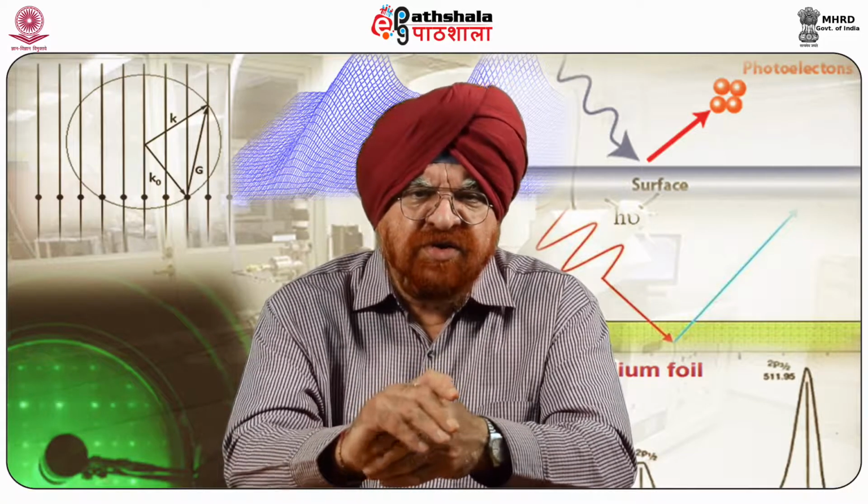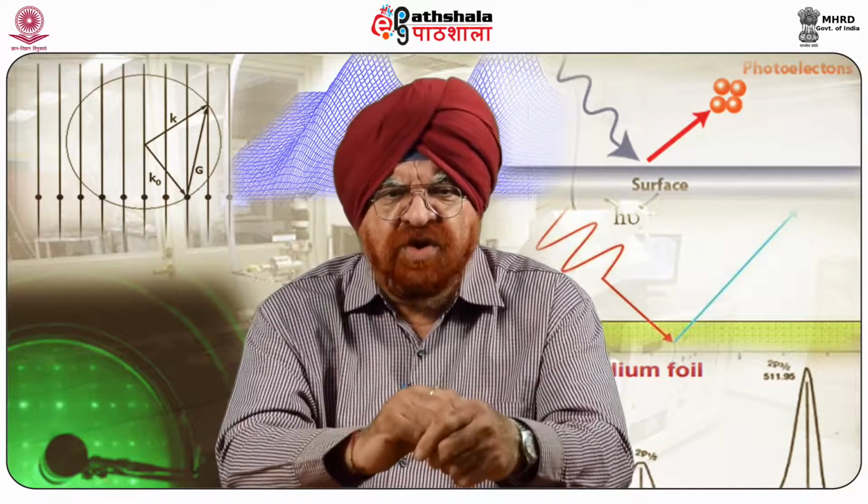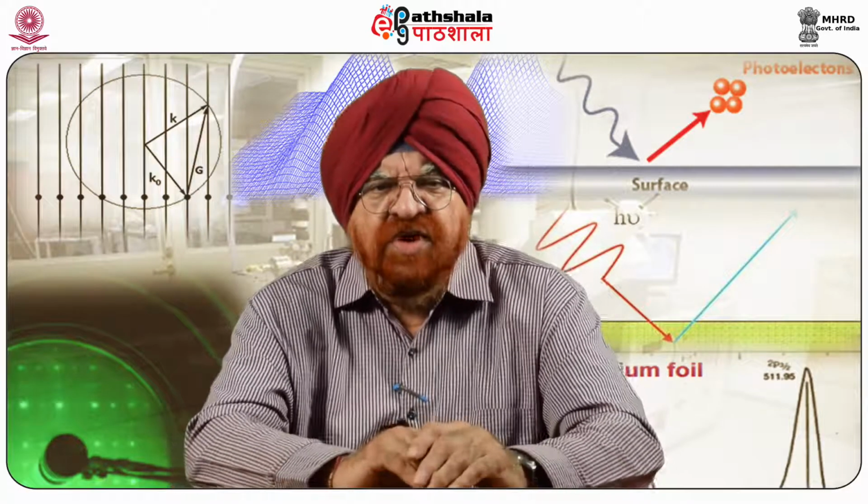Magnetic force microscopy can be very properly summarized when we talk about this module, and I'm sure when you read the summary, you will be able to appreciate this much better. So, it can be summarized as follows: the magnetic force microscopy image of an isolated submicrometer structure present in the SiMn 20% film after thermal annealing at 600 degrees centigrade is checked.